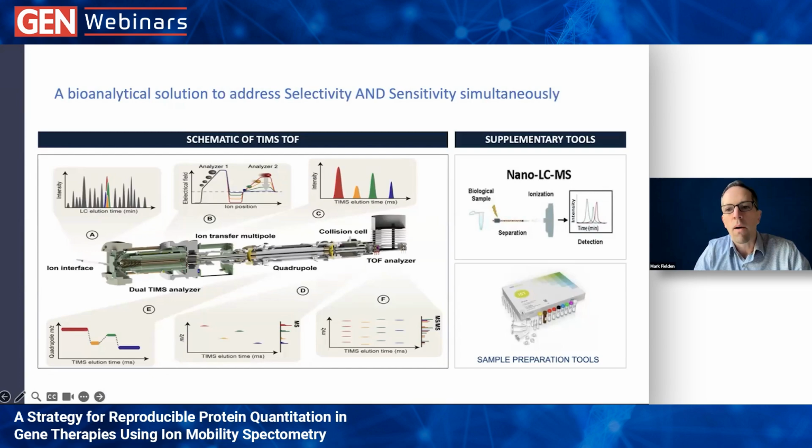The challenges is the development time. It's just not as rapid as an antibody-based approach. And so with appropriate planning, you can get around that and account for it. But it was absolutely critical to support progression of the program. And so we had enough advanced planning to do the development we needed.